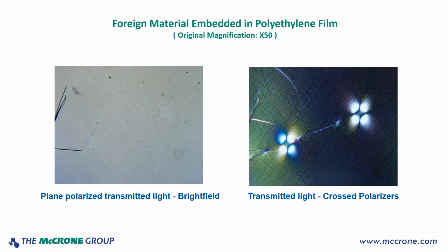So here's an example with the polarized light. The polarizing system has a polarizing filter in the base for the transmitted light, and that's a fixed filter. As the plane polarized light comes through the sample in transmitted light up into the objective lens, we have another filter above the objective lenses that is a rotating polarizing film. So now we can rotate the analyzer, as it's called, and cross the polarizers. And when we do that, we can now see various features.